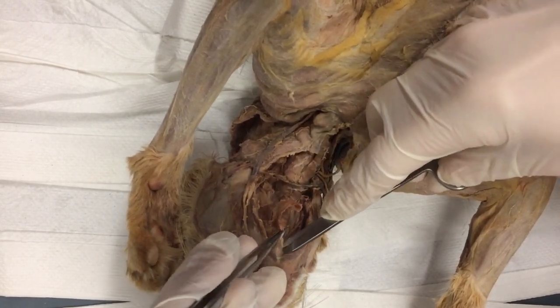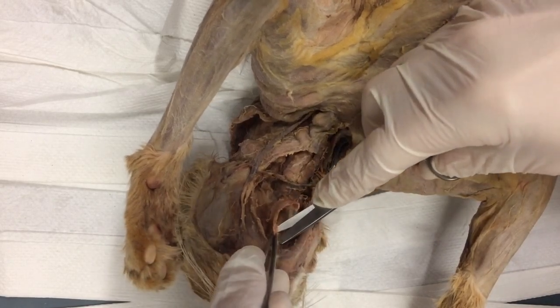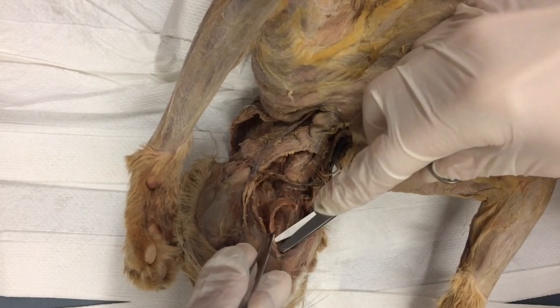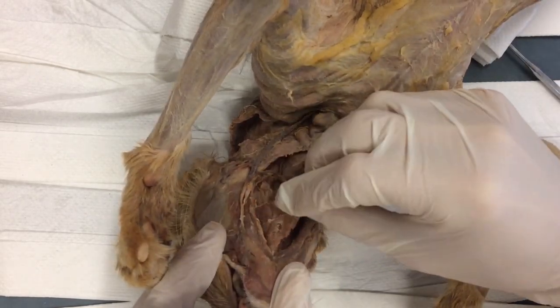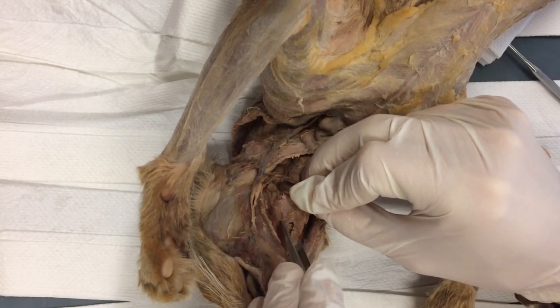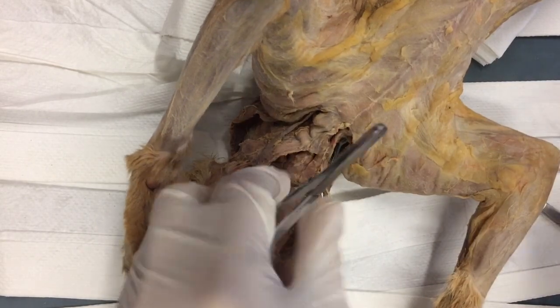All right, now I'm coming over to my 1/3 cut. Finish my 1/3 cut. Back over to my midline cut. Nice and clean. Nice and clean. All right, now I did have that little hole. I promise. If you can do it at least this good or better, I'm not taking any points off. I know how difficult this is.